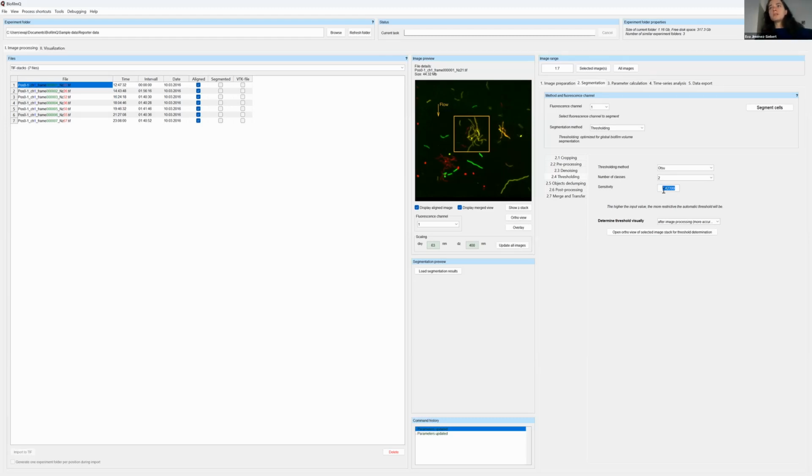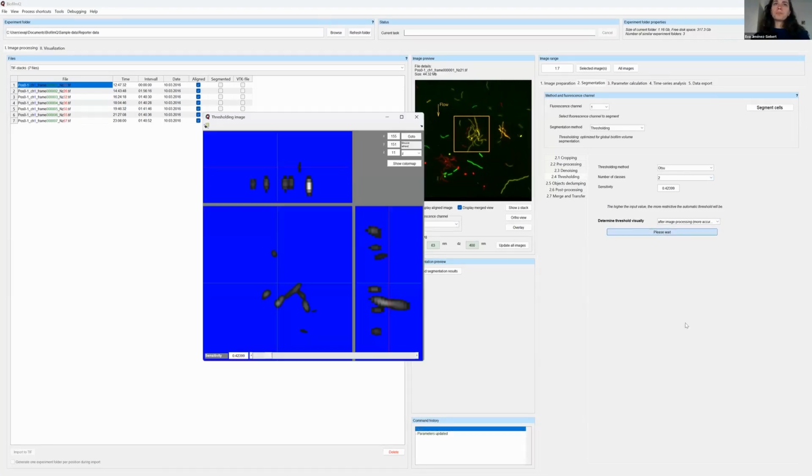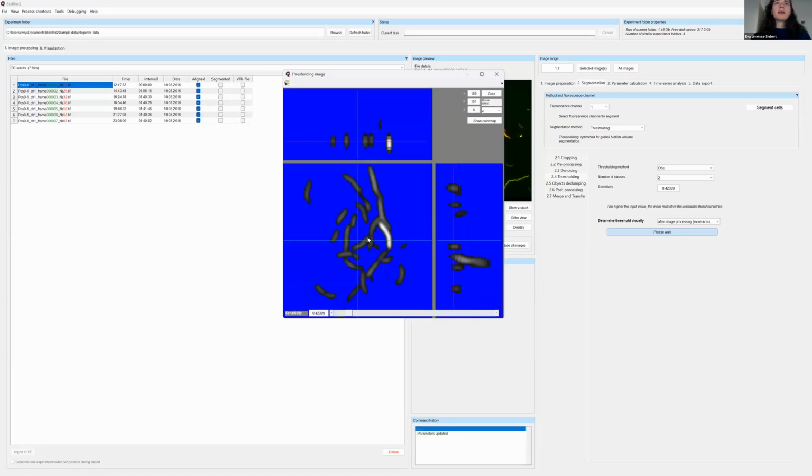And one important parameter that you can set here is the sensitivity. This should be 1 for you, I think, the standard. You can also change this by, again, opening this window. And the sensitivity, what it's going to do is, if by applying the automatic thresholding with OTSU, you always get a threshold that is a bit too high or a bit too low, you can change it with the sensitivity so that it gets a bit lower or a bit higher.